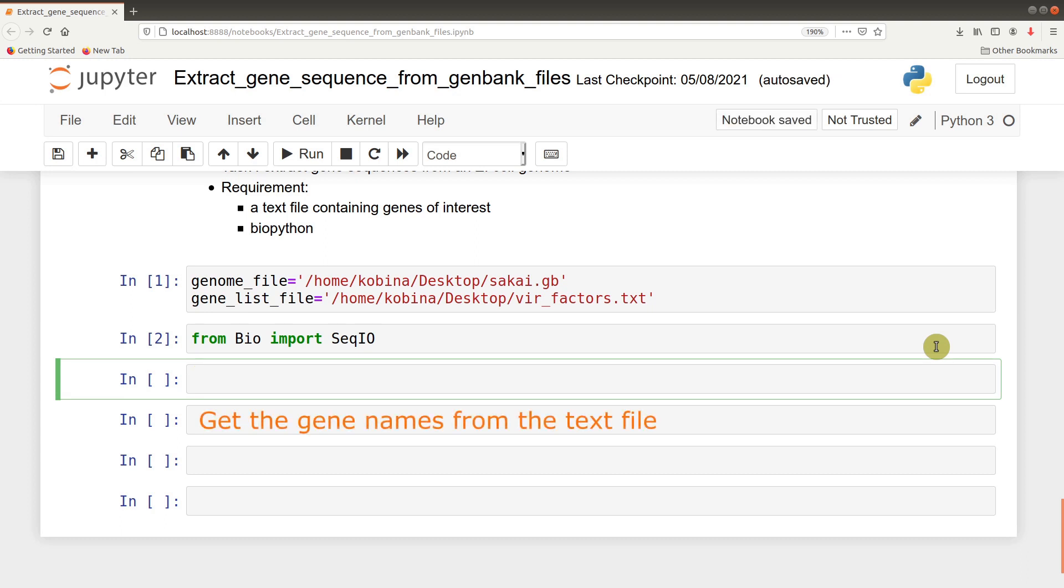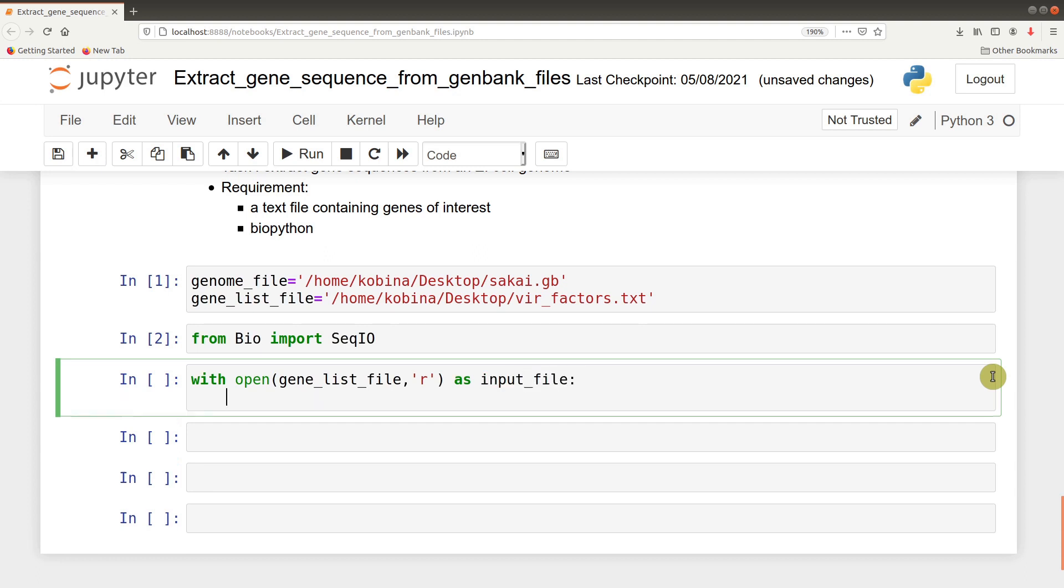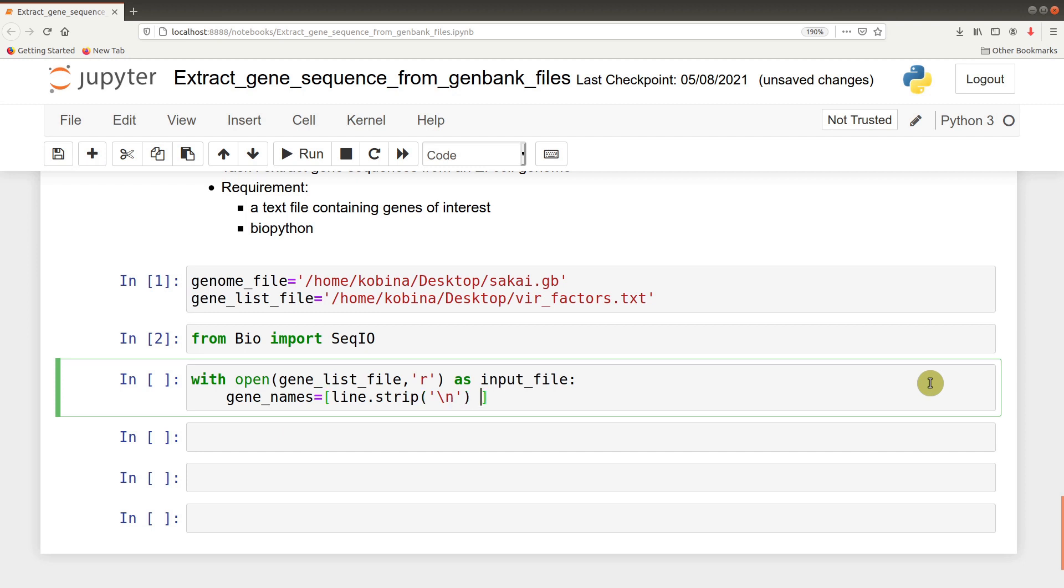We will now proceed to read the gene list first. To read it, we will use this command: with open genlist_file, and then we give the mode as input file. Then we come to the next line where we read it line by line: gene_names equals [line.strip() for line in inputfile]. We are reading it line by line and making sure we remove the newline character.